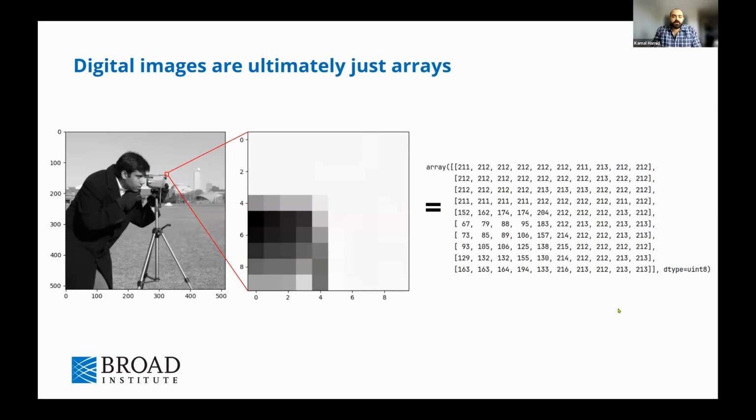And so that's great. Now we have these images that are extremely quantitative because we have these arrays of numbers that can be two-dimensional, like a two-dimensional matrix, which is what we're seeing here. There could be three-dimensional, four-dimensional, and so on in terms of channels, time, and so on. But the question is, how do we really make use of this quantitative data? How do we analyze it?